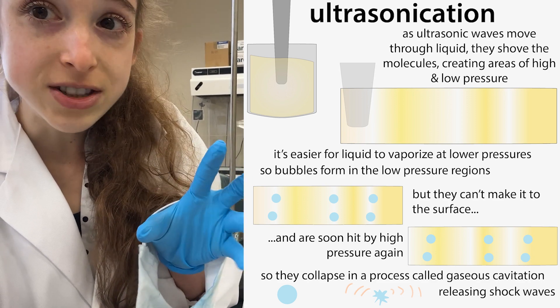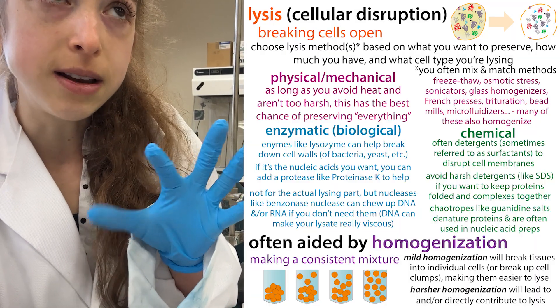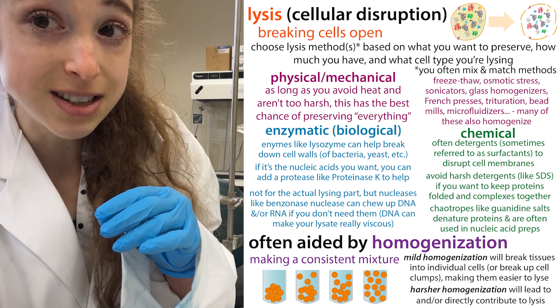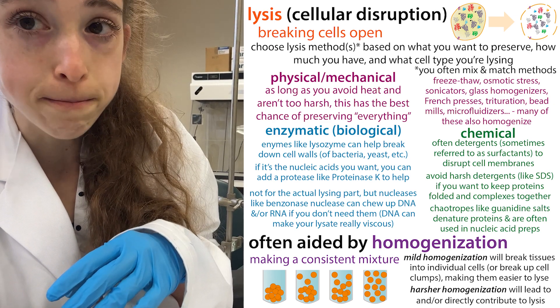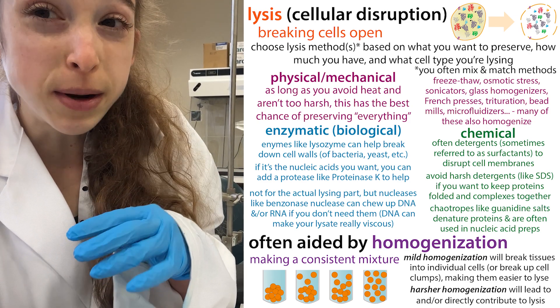You don't want to over-lyse your cells. Especially with mechanical methods like sonication, you don't want to introduce too much heat or do things that could denature the protein, because that's going to potentially cause problems with your purification. So don't go too far with the lysis.